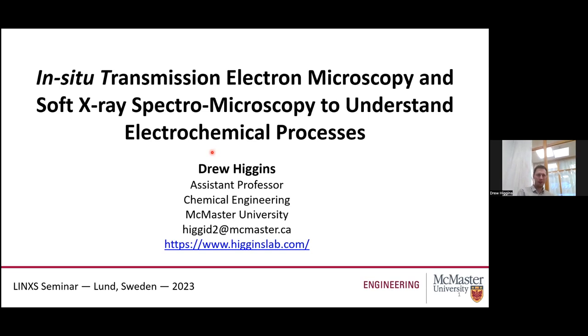I'm an assistant professor at McMaster University. I'm going to be talking about the in-situ characterization of electrochemical processes, or more specifically, electrocatalyst materials, using electron microscopy and using soft X-ray spectromicroscopy.